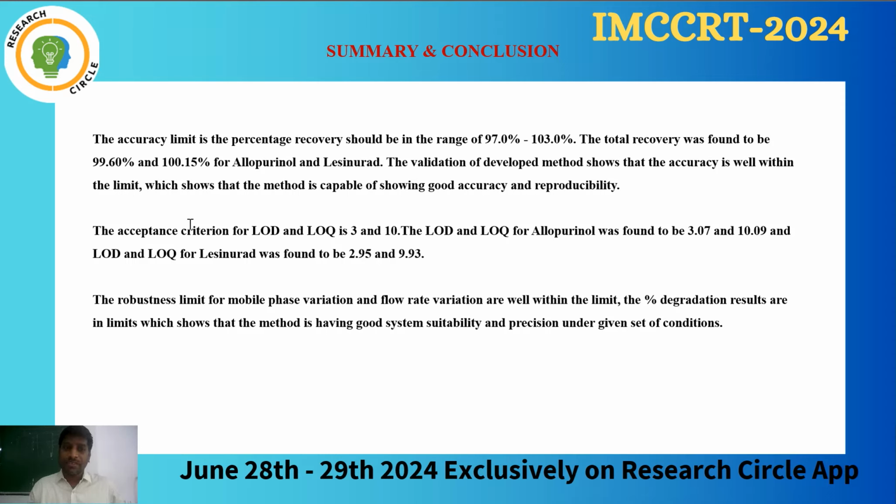reproducibility. The acceptance criteria for LOD and LOQ is 3 and 10. The LOD and LOQ for allopurinol were found to be 3.07 and 10.09, and LOD and LOQ for Lesinurad were found to be 2.95 and 9.93. The robustness limits for mobile phase variation and flow rate variation are well within the limit. The percentage degradation results show that the method has good system suitability and precision under the given set of conditions. Thank you.